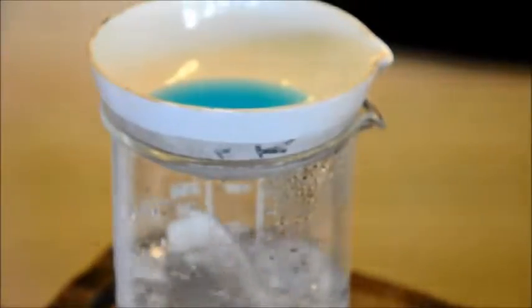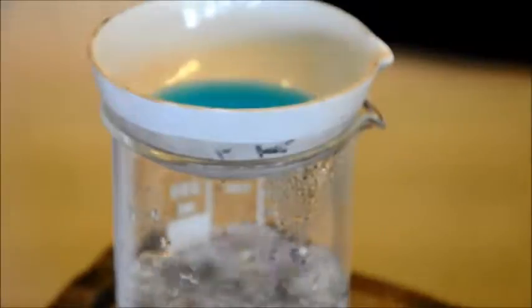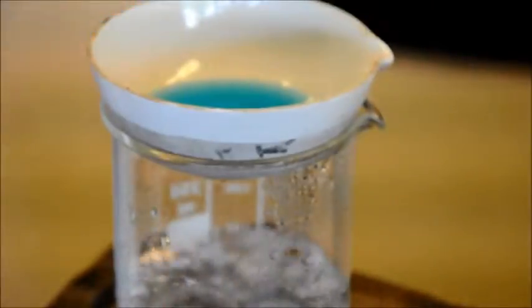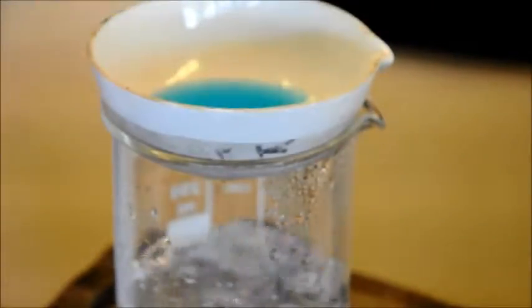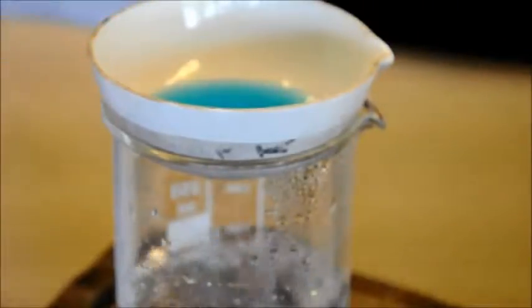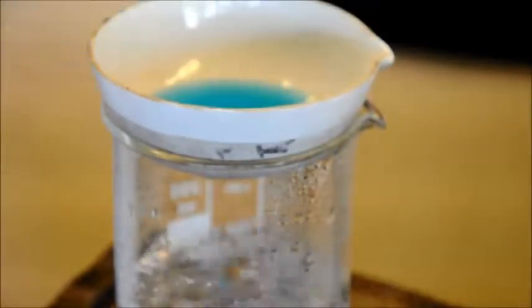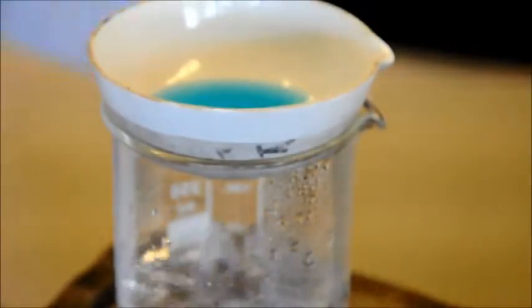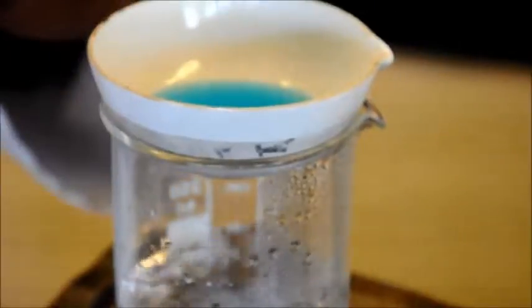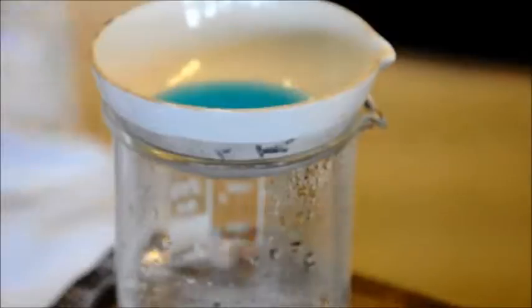So we'll turn the Bunsen off, and before we can handle this, we're obviously going to have to wait for it to cool. There's no point in rushing because it's very hot, and there's a chance that you'll get burned, you'll drop the apparatus, and then you'll get burned. So it's just a case of waiting for 3 to 5 minutes for it to cool down sufficiently for you to be able to touch it so that you can move it and use it.